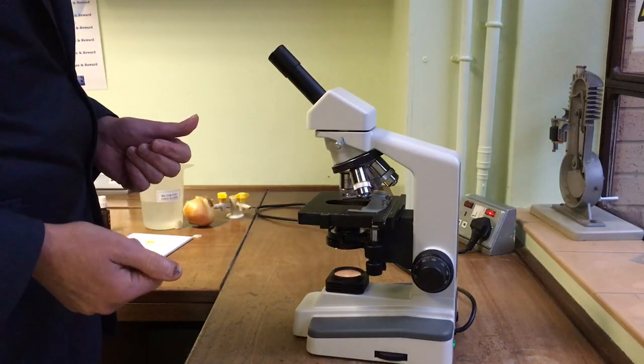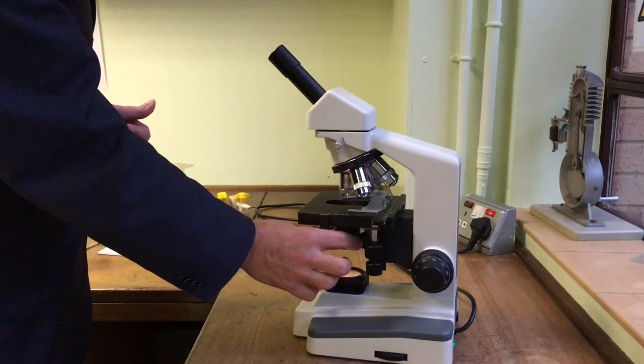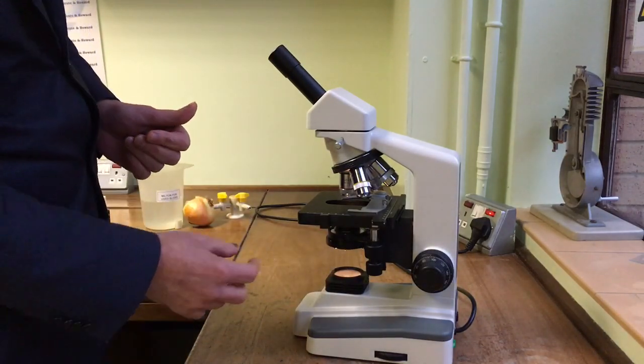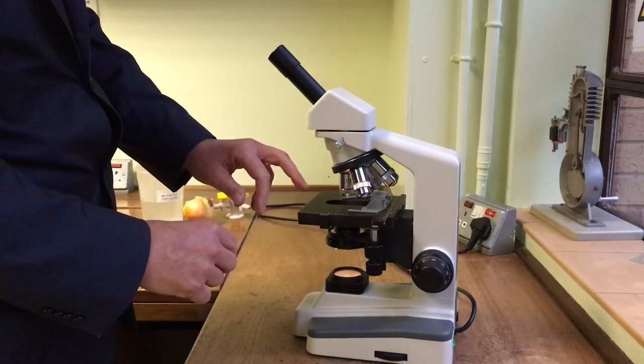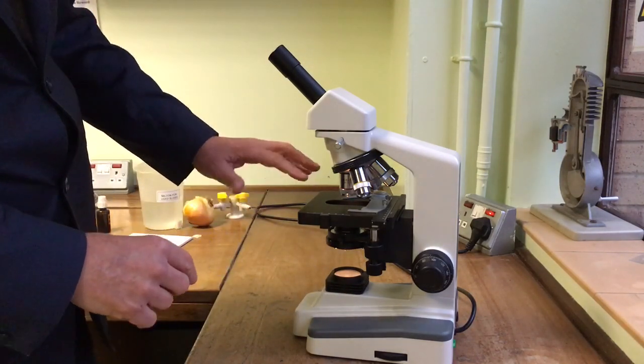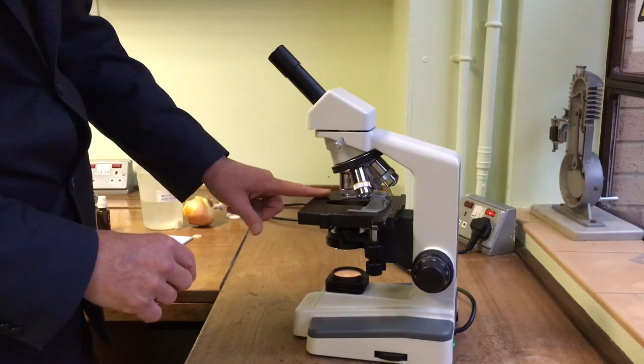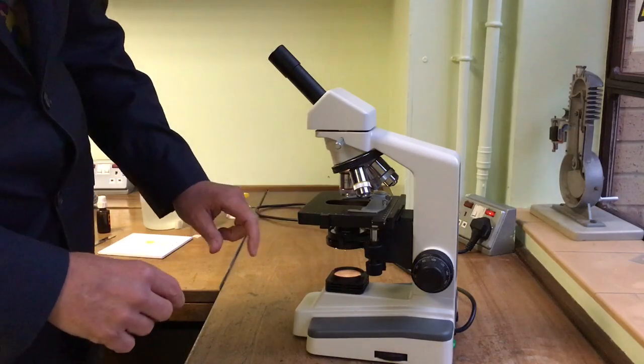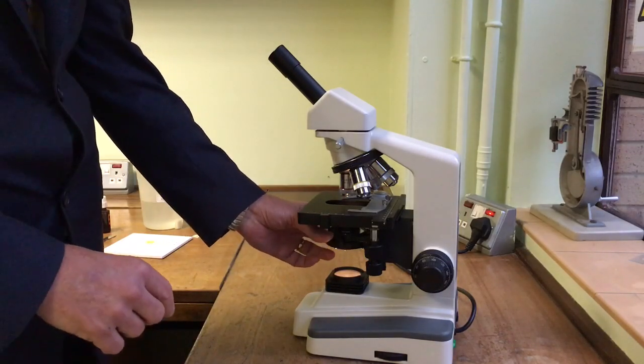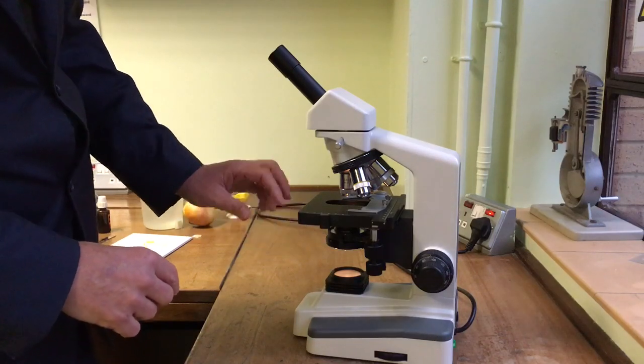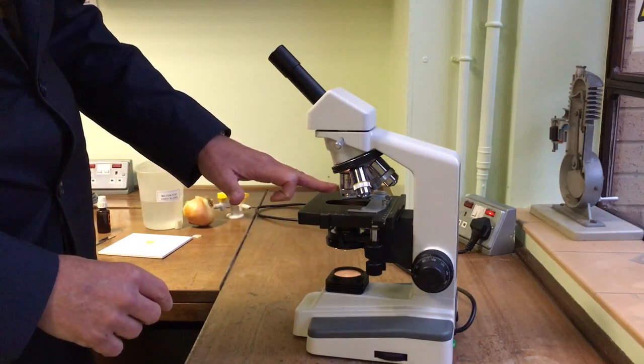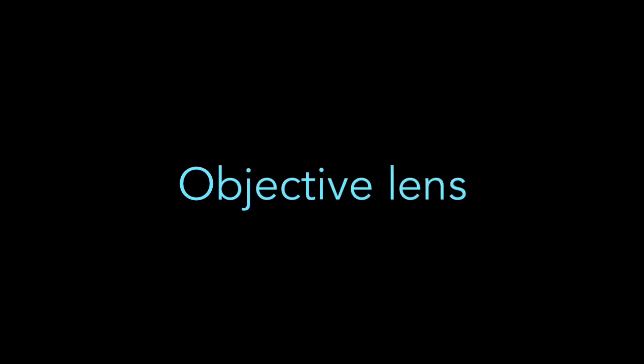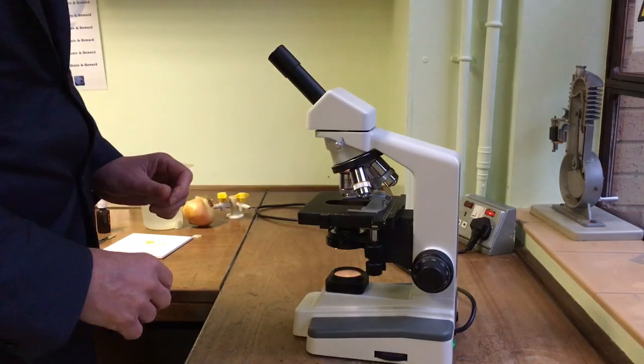This is the school microscope. You can see that it has a built-in light source underneath which shines up from here. To view the slide, the light needs to shine through the slide, which is placed onto this part called the stage. There's a condenser lens underneath which helps to focus the light, and then two sorts of lens: the objective lens and the eyepiece lens. I'm starting with the lowest power objective lens.